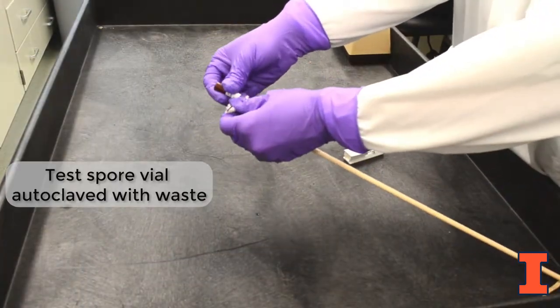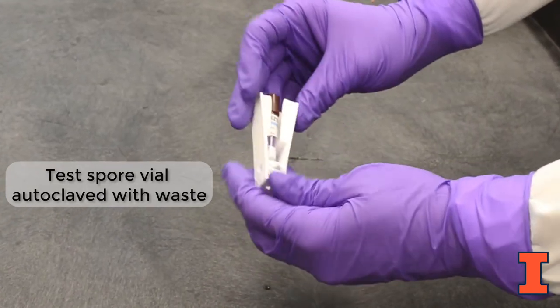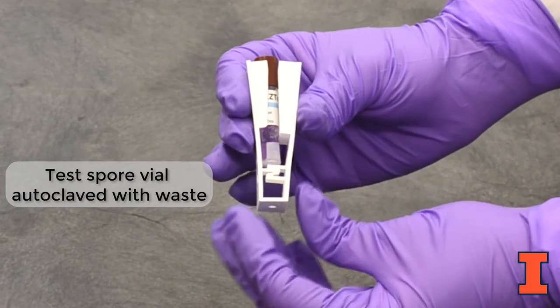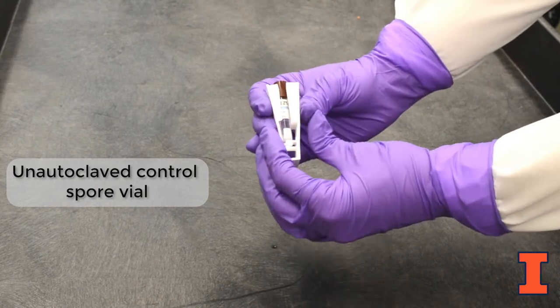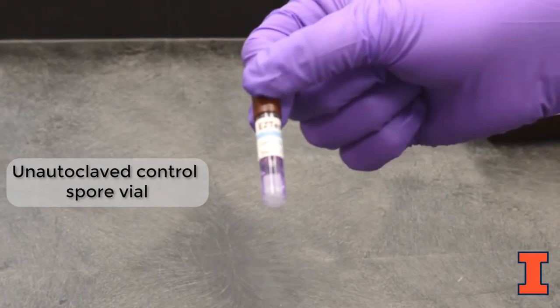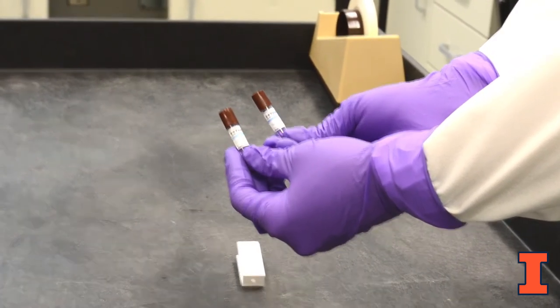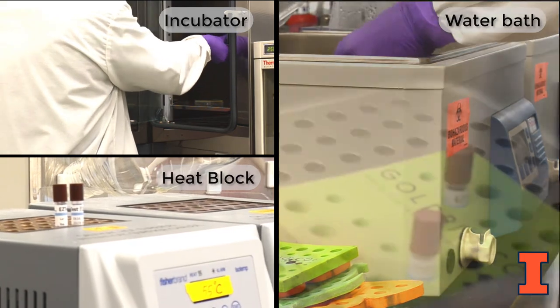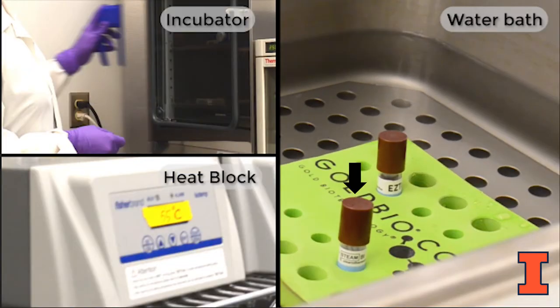To perform the validation test, place the test spore vial that was autoclaved along with your biological waste into the crusher tool. Gently apply pressure to break the inner ampule containing purple media. When done correctly, the paper will appear saturated. Next, use the crusher tool to activate a control spore vial that has not been autoclaved. This will serve as a control to ensure that the bacterial spores, when not inactivated via autoclave, grow well. This must be performed initially and at least once annually. Incubate the vials in a vertical position in an incubator, heat block, or water bath set to 55 degrees Celsius for 12 to 24 hours. If using a water bath, ensure that the brown cap of the vial and the holes on the top are not submerged under water.